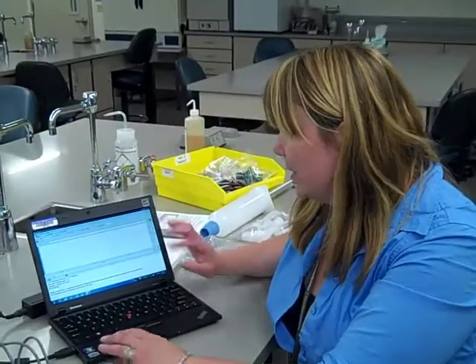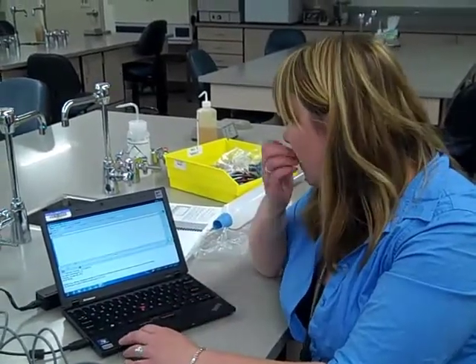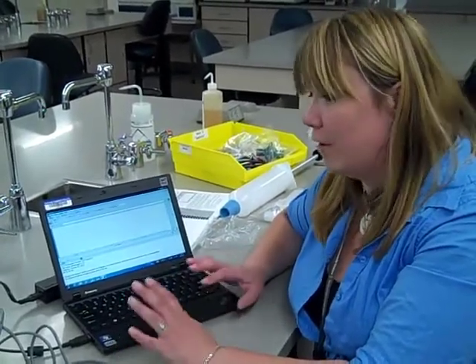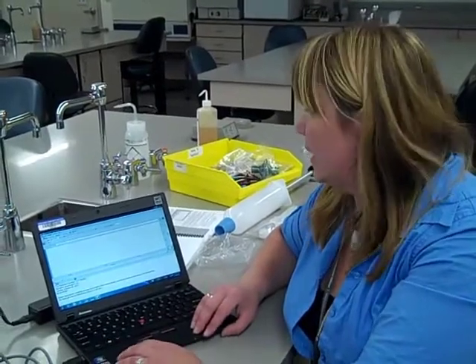So the point of the exercise is to allow you to take one of these charts that you'll generate from doing the exercise, and then relate that to an actual breath so that you know what a tidal volume is, what a lung capacity is, and where that data comes from. So you don't have to spend a lot of time doing calculations or measuring each individual wave in your graph. All you really need to know is, when you look at that graph, what does that spike mean, where does that information come from, and how does that relate to what's actually happening in your lungs. And that is the take-home message from this BioPac exercise.